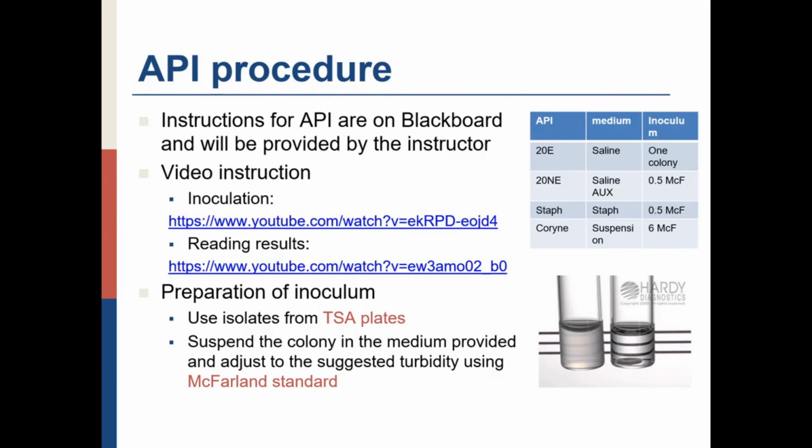It has a number, and the higher the number, the more turbid the solution is. So you suspend your colony in the liquid, and you want it to be the same amount of turbidity as the McFarland standard that you're comparing it to.